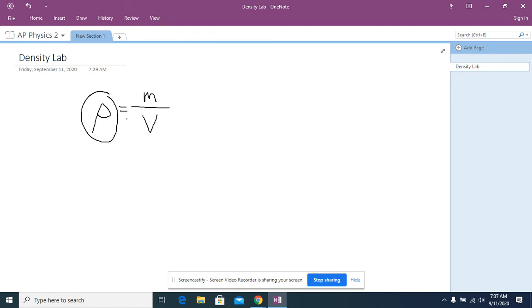The way that we're going to conduct every experiment is that we're going to take the equation. So this time around in the course, we'll tell you the equation that we're trying to model first to give you a little assistance on what you're trying to do. So we're looking for this, and we need to solve that. So the idea here is, let's figure out what this will be. Now, technically speaking, you could just simply take a mass reading, take a volume reading.